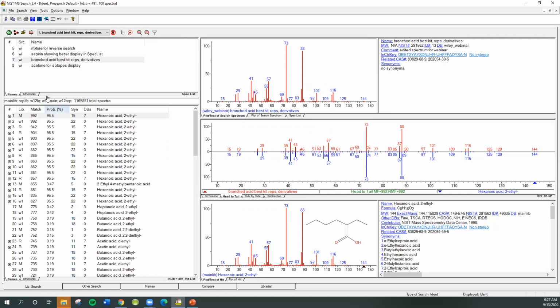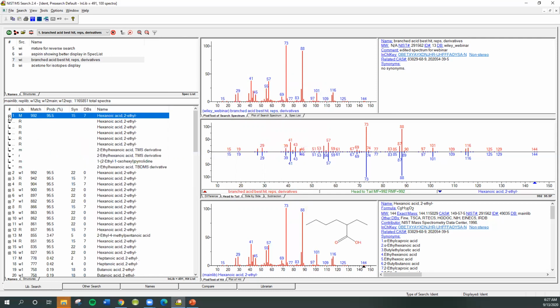All right, so let's go up here and look through a couple of other things we have here. You can see the little pluses here. If you expand those, that'll show you other things, replicates. So a lot of times on a different instrument, the spectrum might be slightly different. So you might want to get an idea of how other people see it.